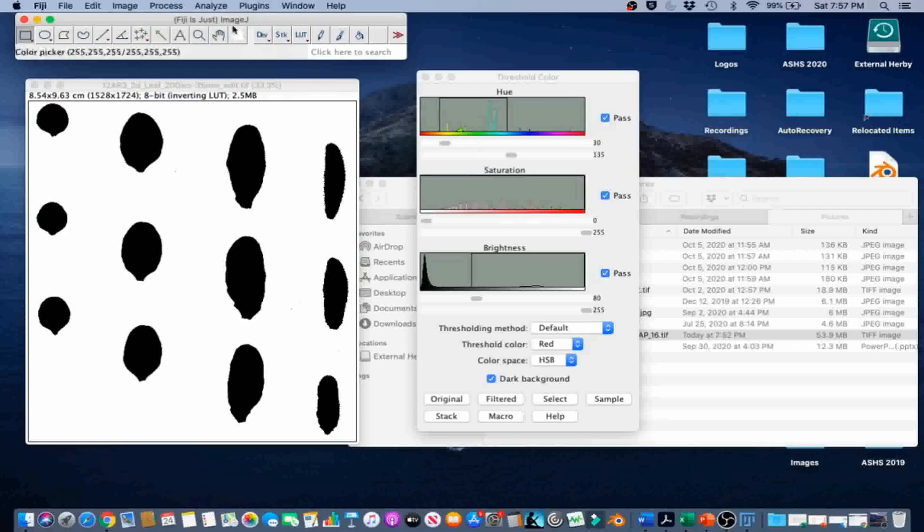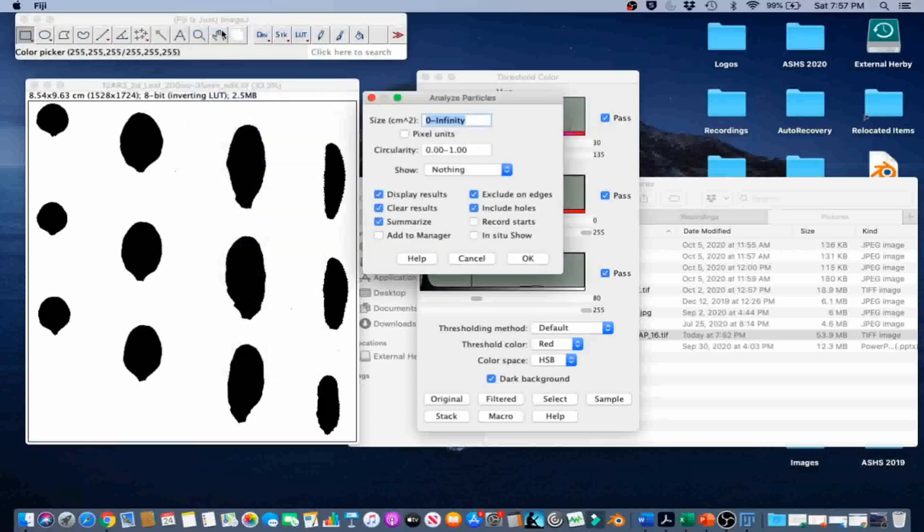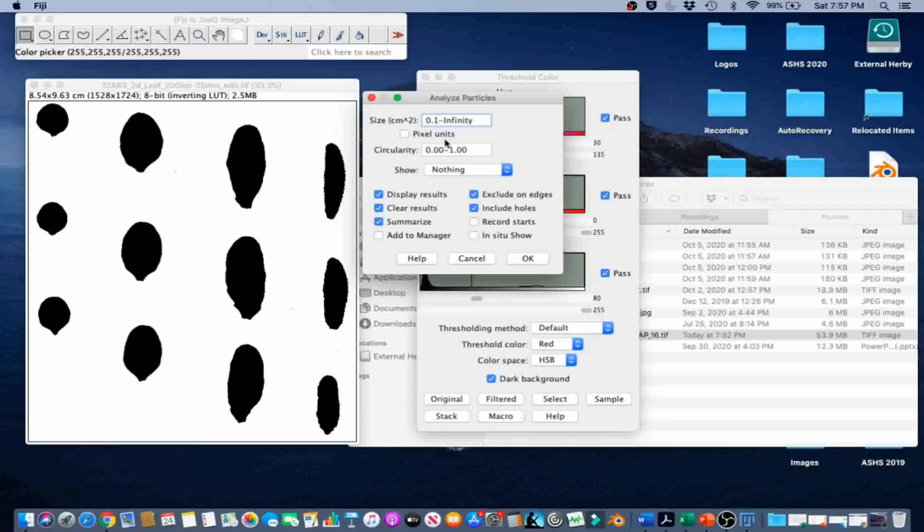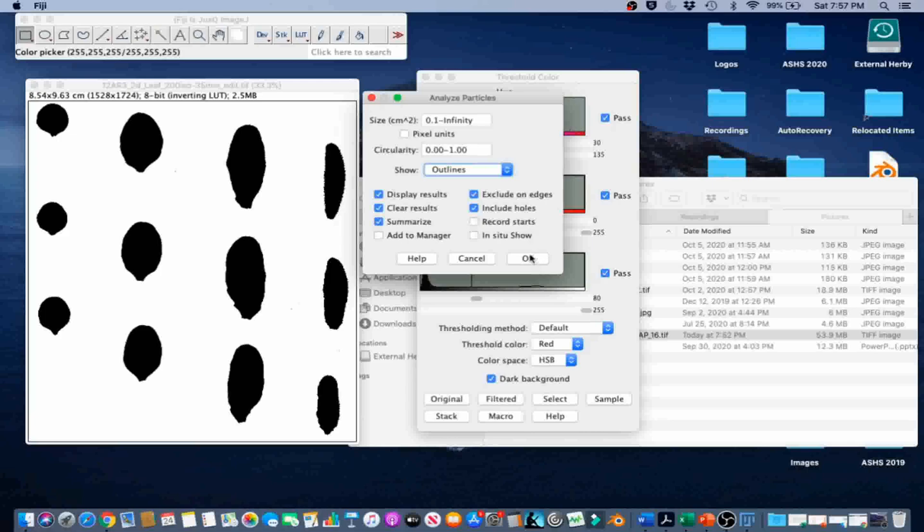And then Analyze, Analyze Particles to count the leaves and to measure the individual area of each leaf. We are going to enter 0.1 to infinity for size, 0 to 1 for circularity, and in this case Show Outlines. We are going to leave the pixel box unchecked. We started the size from 0.1 so that we could exclude some of the little particles that are not the leaves. We are going to go ahead and click OK.